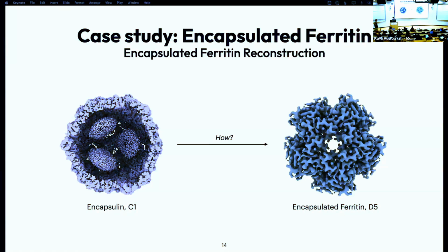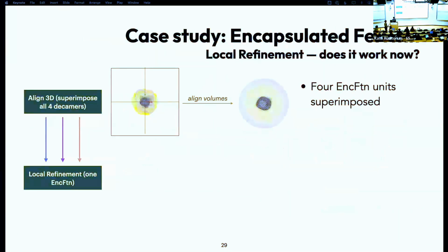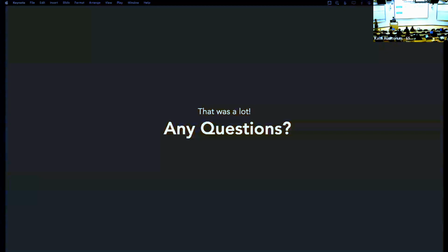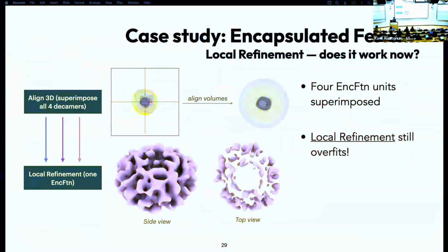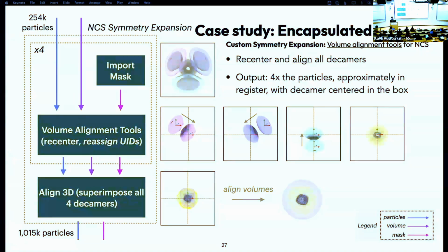What you would have to do in pretty much any case is, I don't have a slide showing exactly it, but you would have to use volume alignment tools to realign that portion of your structure that is D5, for example, to the correct symmetry axis. If you have this symmetry mismatch where it's C3 and D5, it's unlikely that they will both have the same symmetry axis and be already aligned.